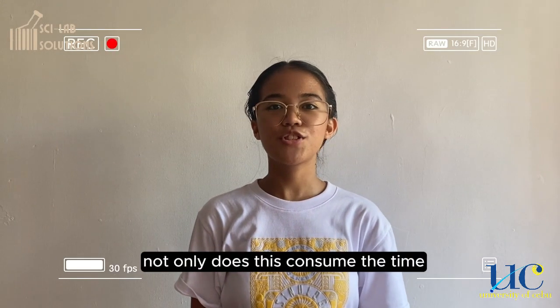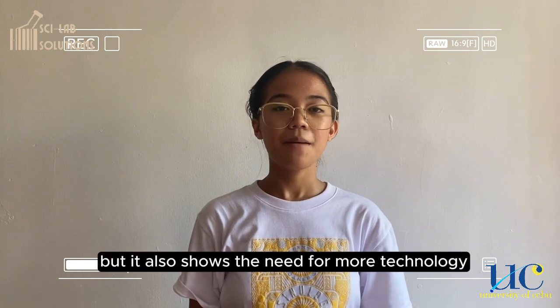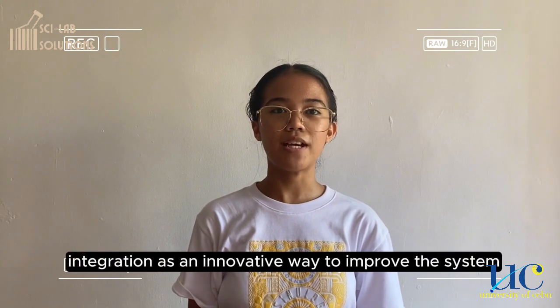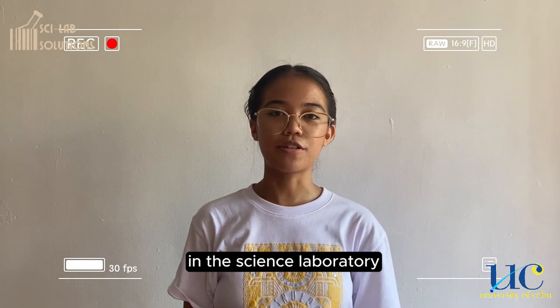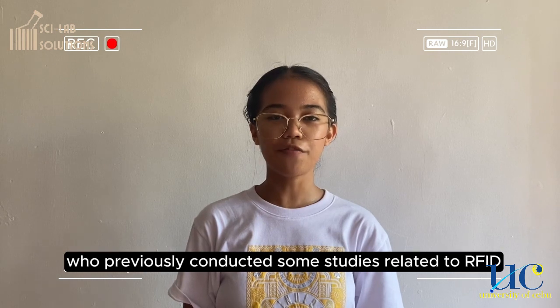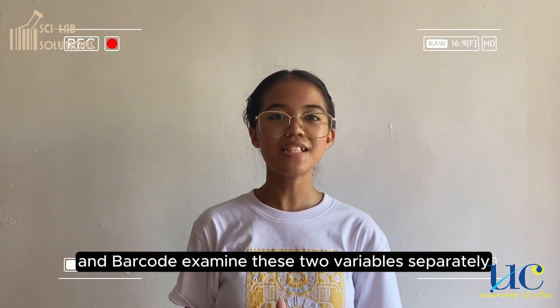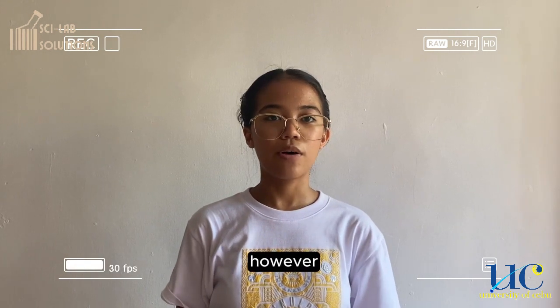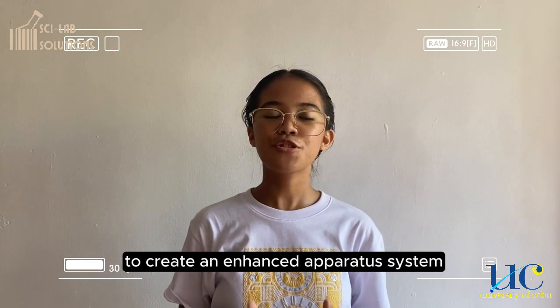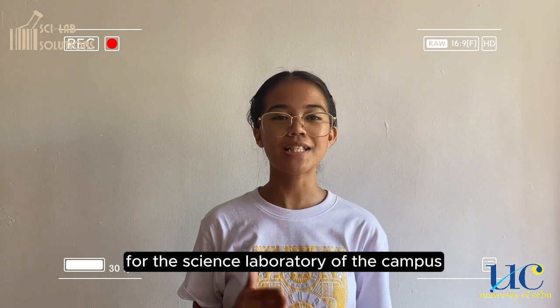Not only does this consume the time students spend borrowing, but it also shows the need for more technology integration as an innovative way to improve the system in the science laboratory. Most people who previously conducted some studies related to RFID and barcode examined these two variables separately. However, this study focuses on utilizing both RFID and barcode to create an enhanced apparatus system for the science laboratory of the campus.